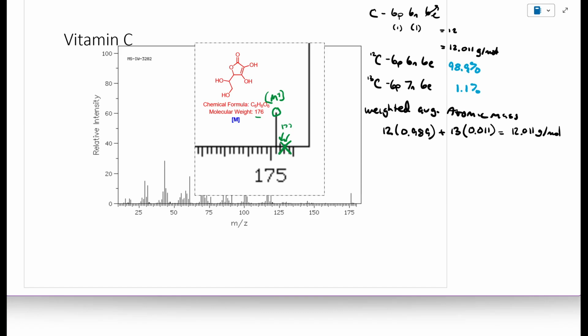So for our purposes, we can acknowledge that, yes, there are some peaks greater than the molecular mass, where there really shouldn't be, and those arise from the natural abundance of carbon-13. We can feel safe and secure that we are back in organic chemistry, and then we can ignore them, focus on the M+ peak, which again is the tallest peak in the cluster furthest to the right, and we can continue our analysis from there. So from now on, you can just ignore those small peaks to the right of the M+ peak.